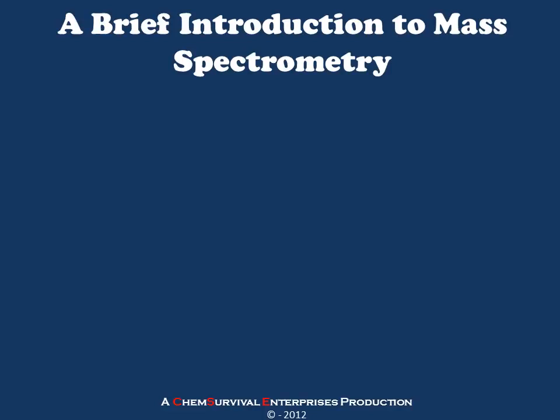Welcome to a brief introduction to the principles governing mass spectrometry. I'm going to show you a very basic mass spectrometry experiment and how these instruments function, keeping in mind that there are many different ways to accomplish the goals that I'm about to show you.